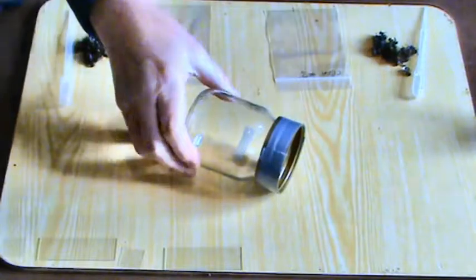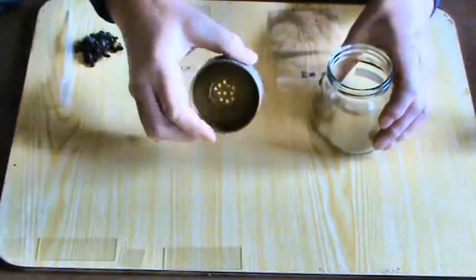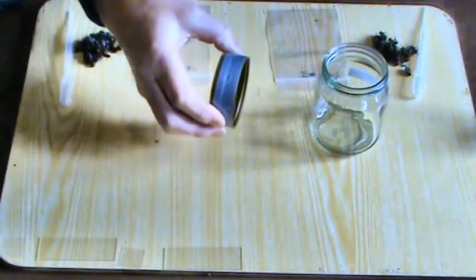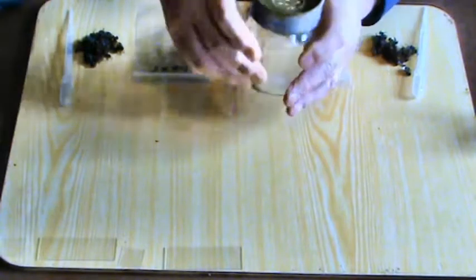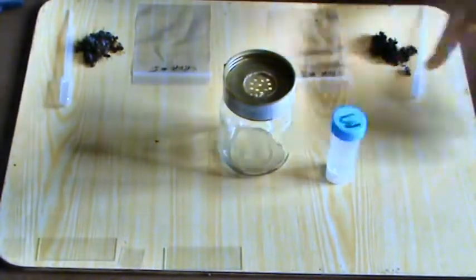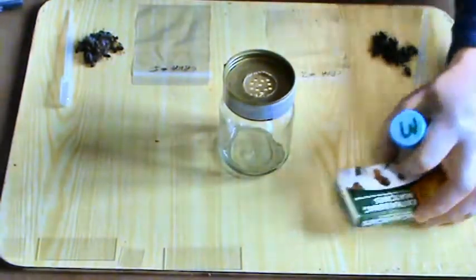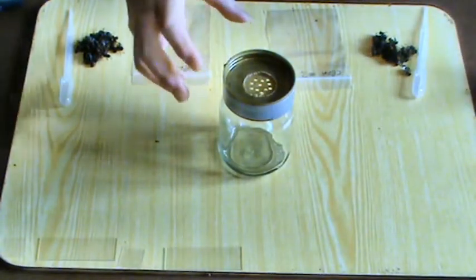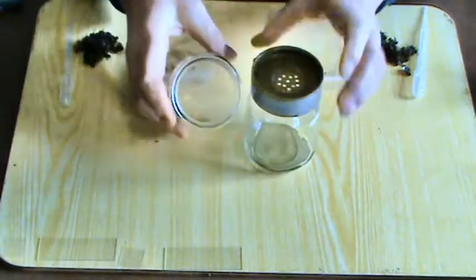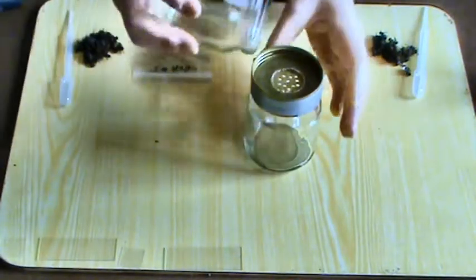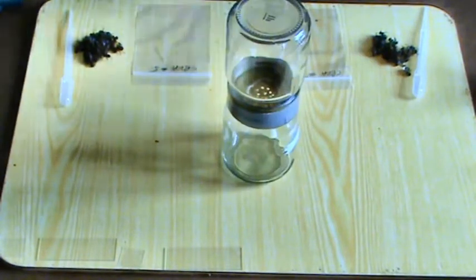Or you can use a jar like this which has got a lid on with holes in, so it's two lids back to back. Collect them in there, lid on. And then you can either put all of these, whichever you collect your sample in, in the freezer. Or with this one you can put in a second jar over the top your killing fluid, tissues with your insect killing fluid from the section on there and then just leave it and the bees will die.